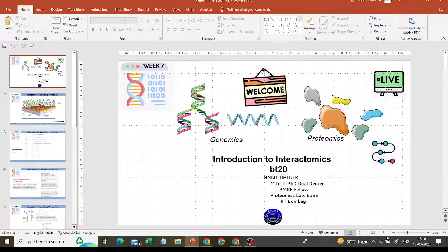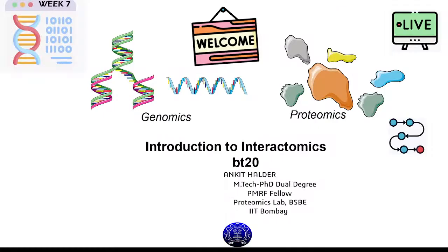If you have gone through the lectures thoroughly this week, you could see that in surface plasmon resonance there is a surface where the ligands are immobilized. You pass your analytes through, and then you try to find out how strong the association or dissociation is, and all the binding kinetics between the protein and the ligand can be understood from it.